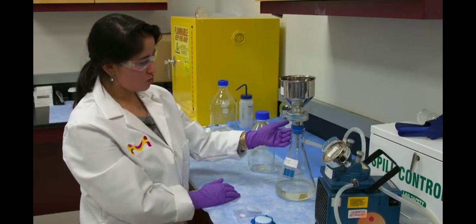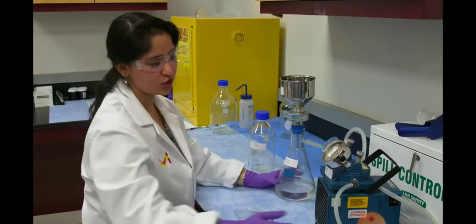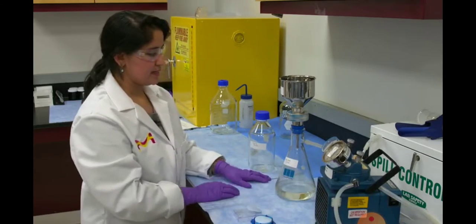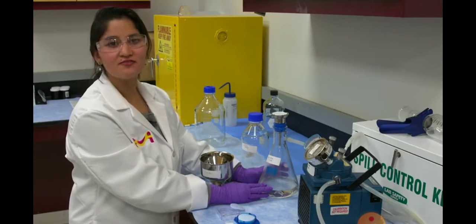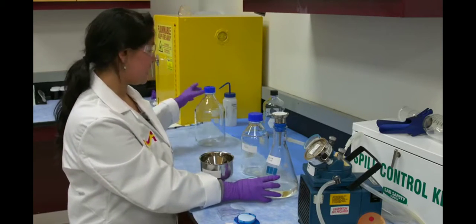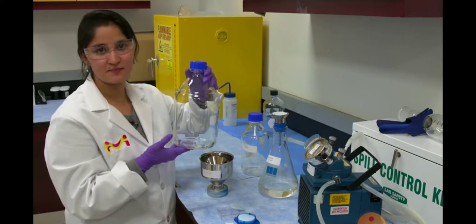Once you see that there's no mobile phase being filtered in the sidearm anymore, now you can turn off the vacuum pump. Now open the funnel. Now that you have your filtered mobile phase, take it and pour it in a clean container that is ready for HPLC.